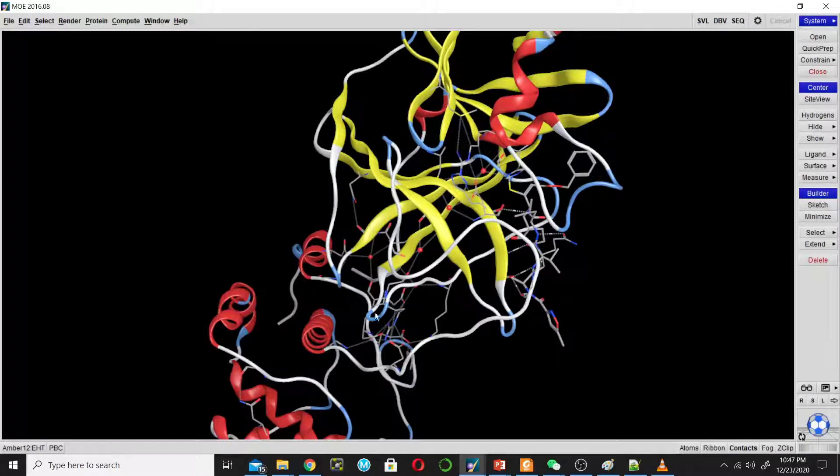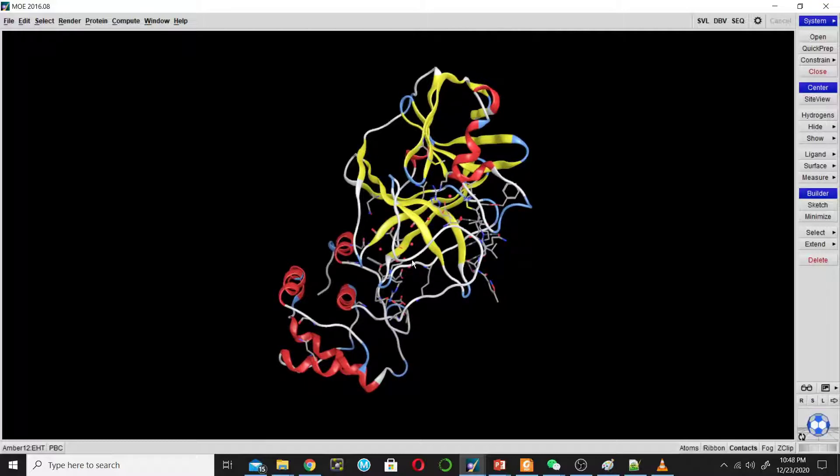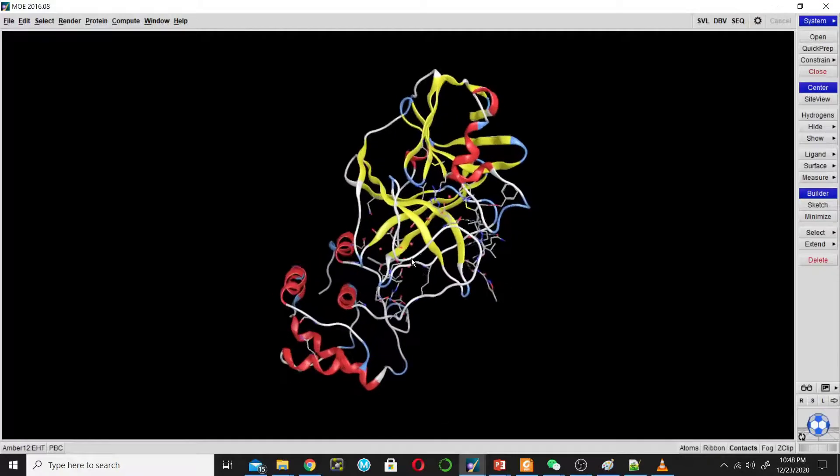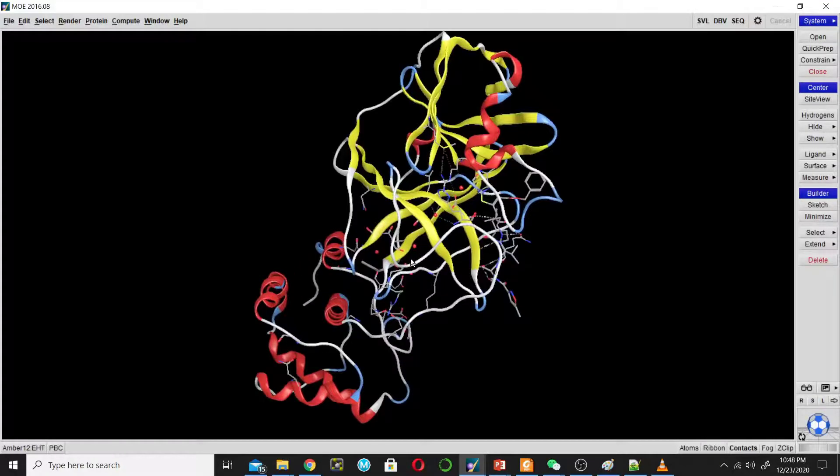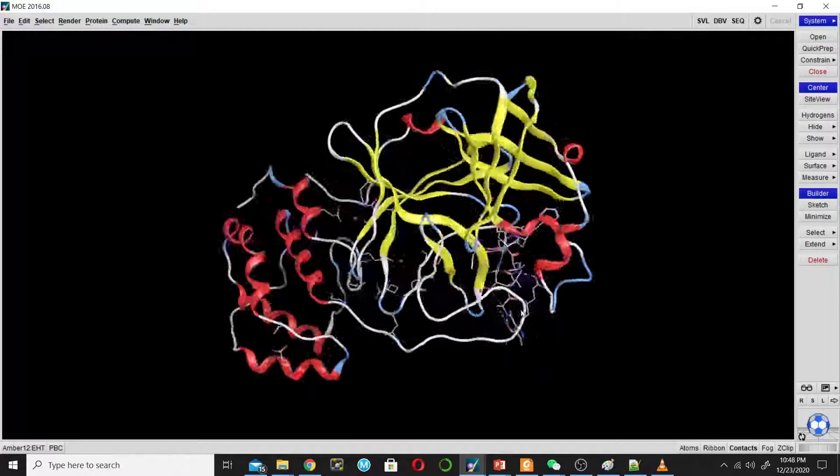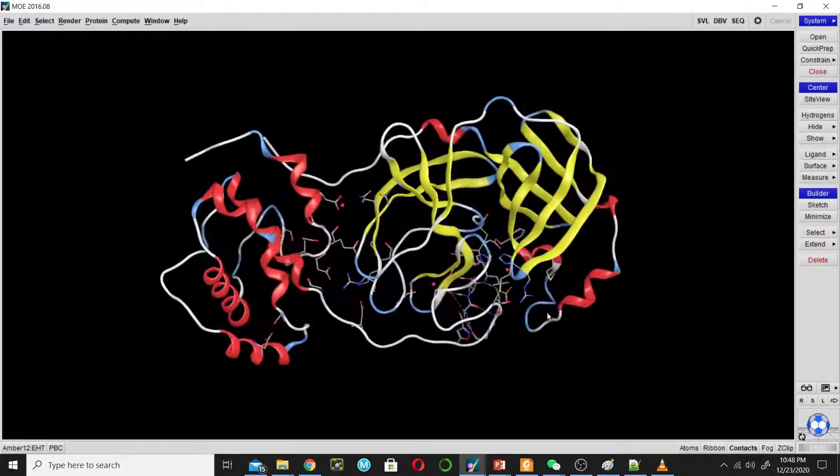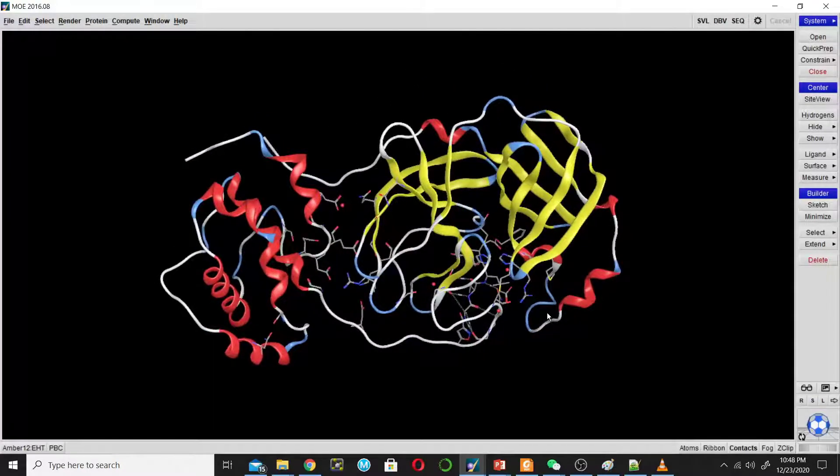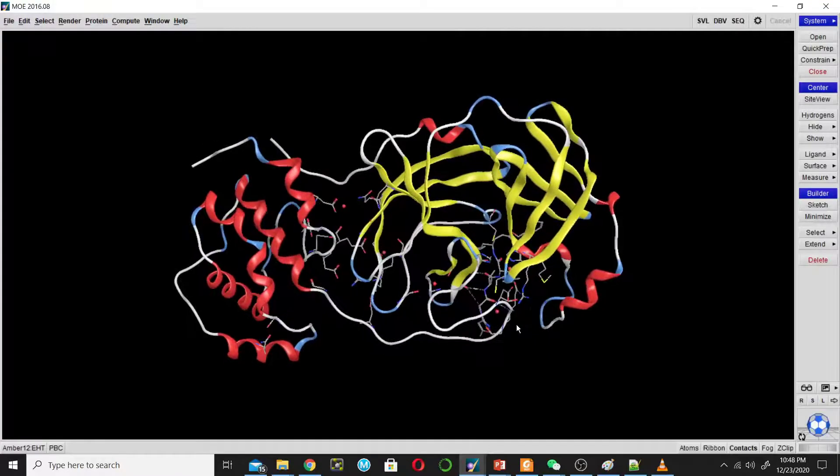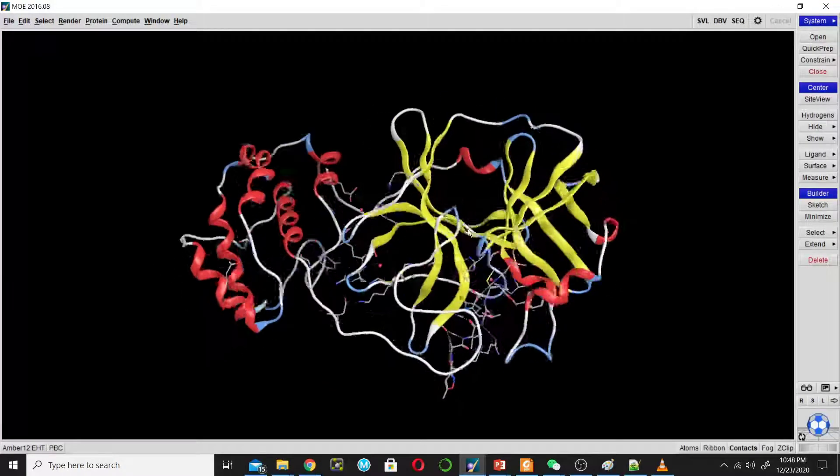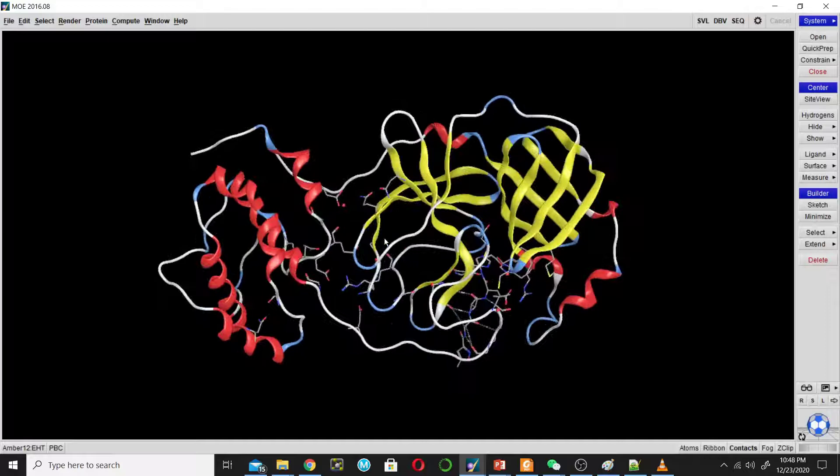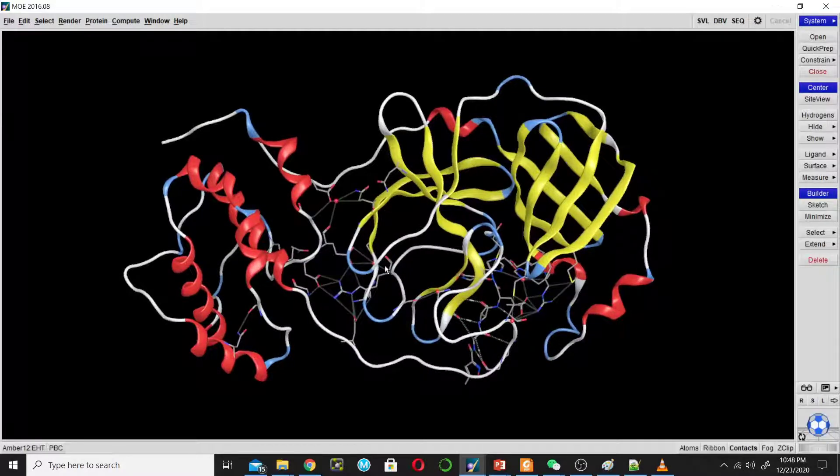You can zoom out this structure by clicking on your middle button of the mouse like this, and you can rotate it by pressing the middle button and moving your mouse around. You can see that this protein is shown in two different representations.